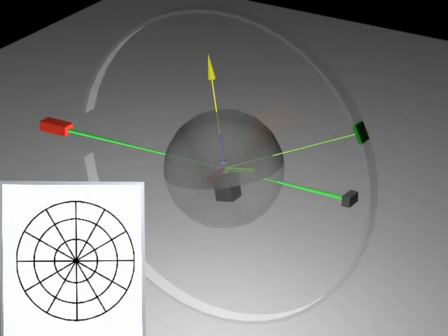Here, diffraction for a single family of crystallographic planes is shown for a single scattering vector aligned with the loading direction. Consider the space of all possible scattering vectors. It defines a sphere in the sample coordinate system centered on the diffraction volume. Data associated with each scattering vector, such as orientation, density, or lattice strain, can be plotted as scalar fields on this sphere. Such a plot is referred to as a pole figure.